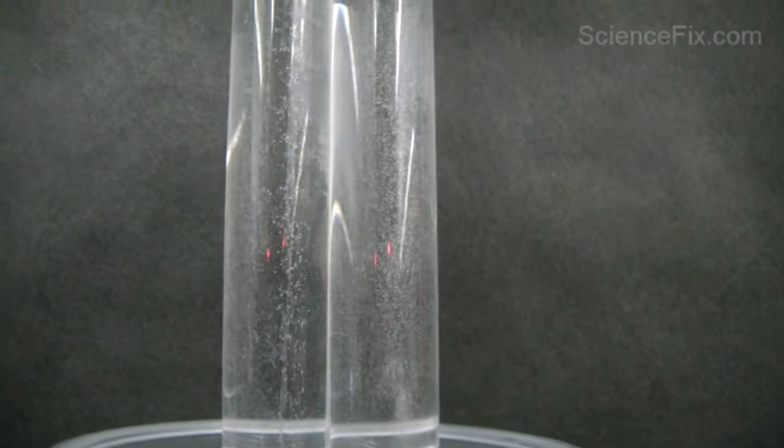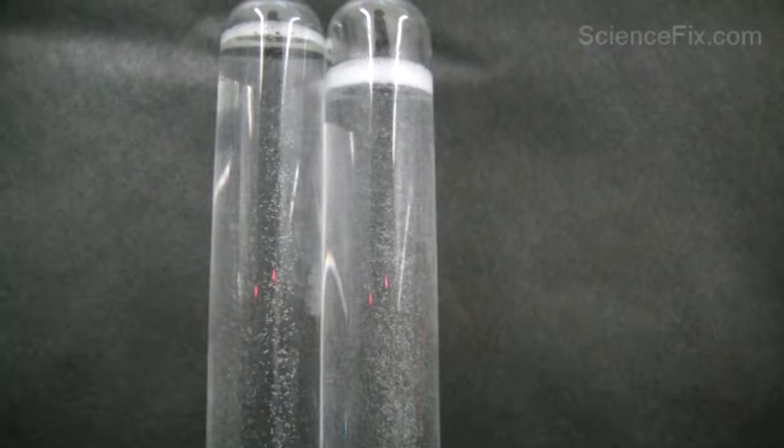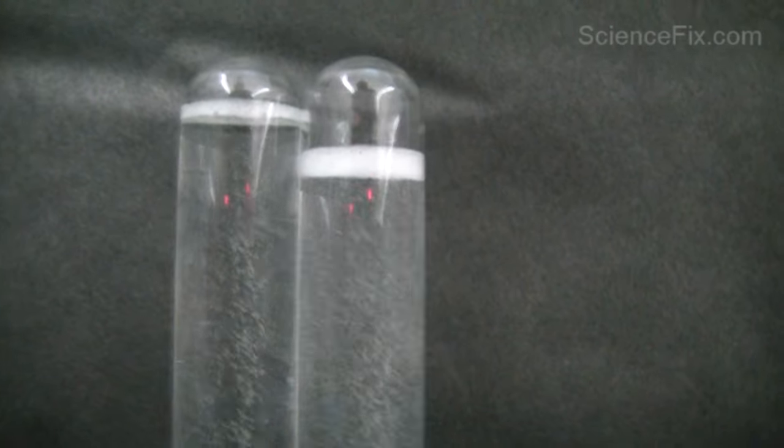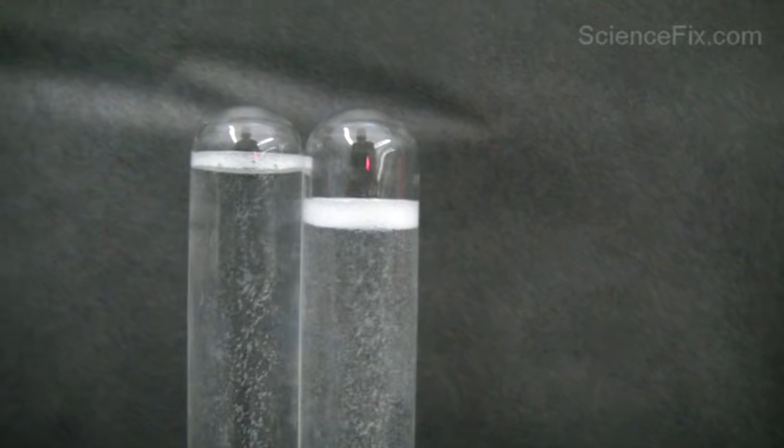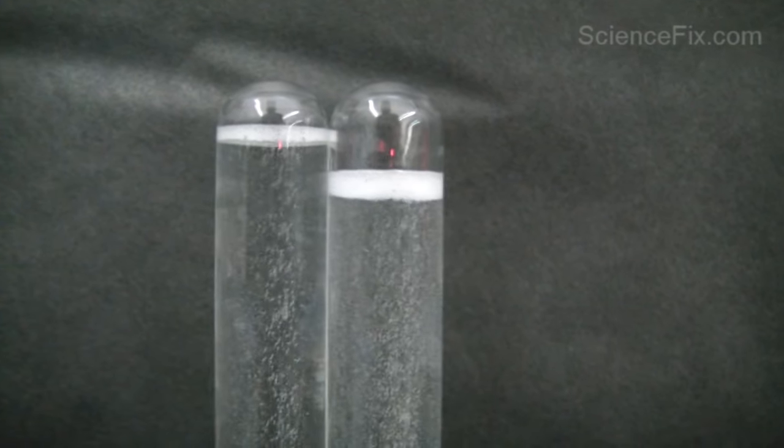How do you know which one's which? If you take a look at the amount of gas in each test tube, it's going to be twice as much hydrogen gas as oxygen gas. You can see in the right test tube you have twice as much hydrogen gas as oxygen gas.